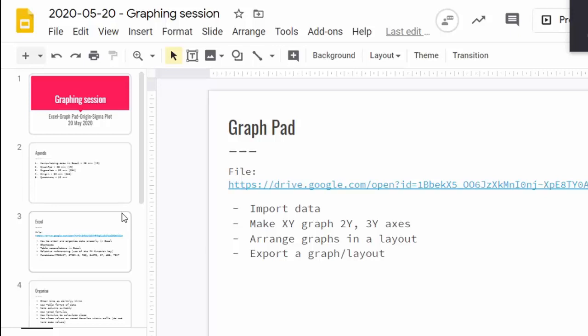I haven't mentioned anything in terms of what is the yield, what is the titer, but maybe that will happen another time because we haven't looked at the glucose concentration, we haven't looked at nitrogen concentration, but I suppose we'll do that another time. Yeah, I think that's all I have.